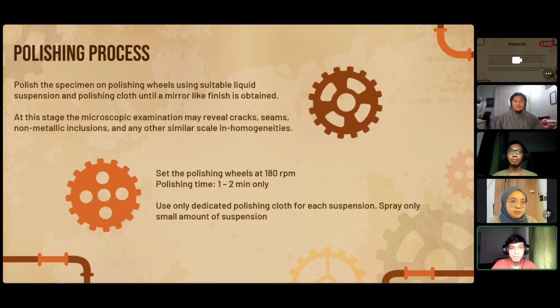Okay, for the polishing process. Polish the specimen on polishing wheels using suitable liquid suspension and polishing cloths until a mirror-like finish is obtained. At this stage, the microscopic examination may reveal cracks, seams, non-metallic inclusions, and any other similar scale inhomogeneities.